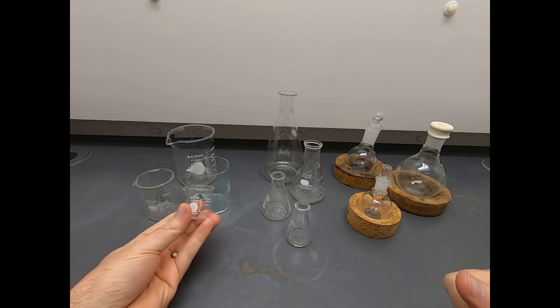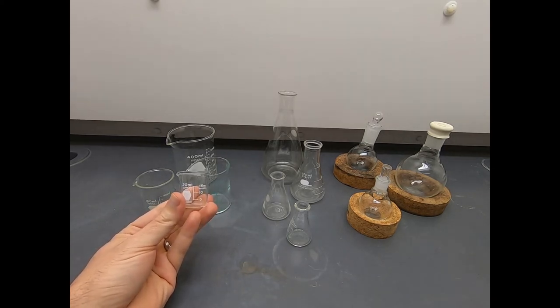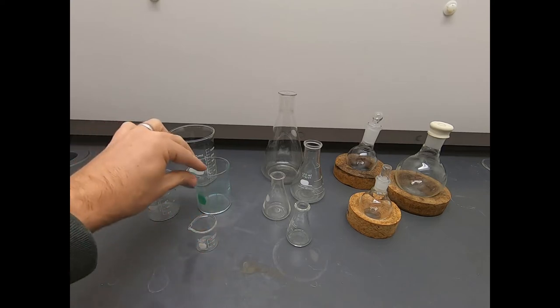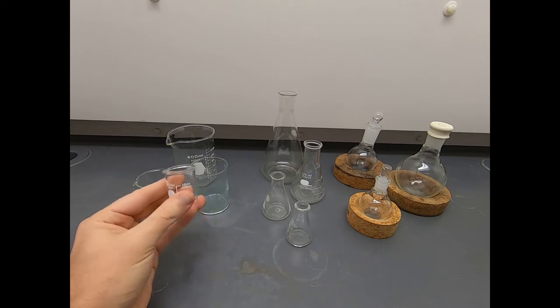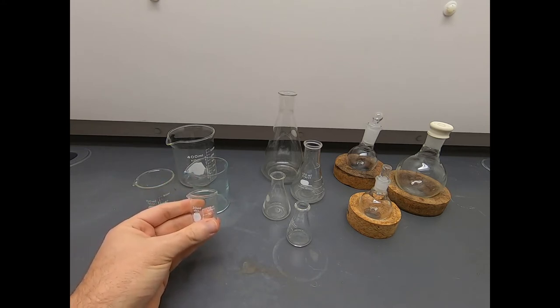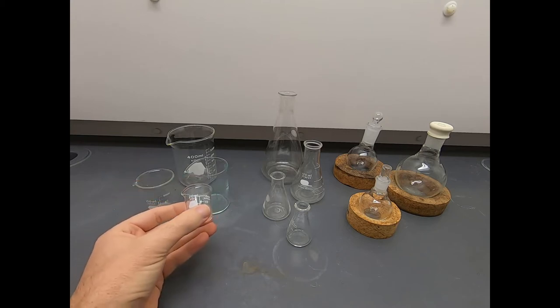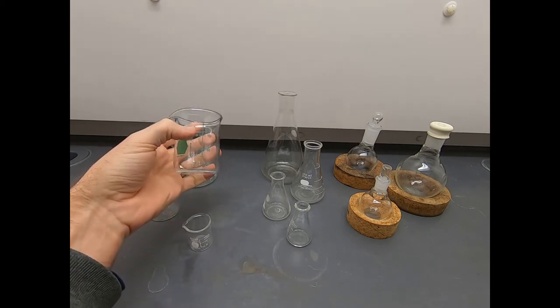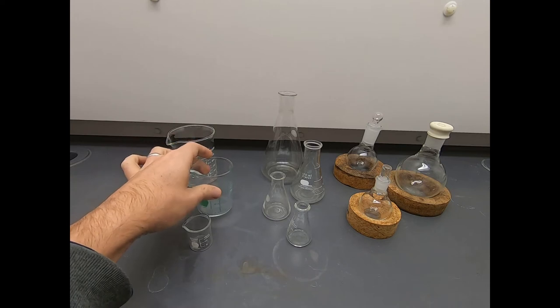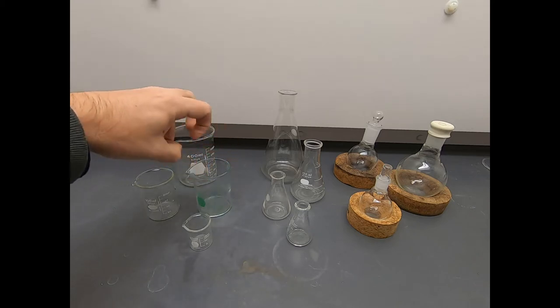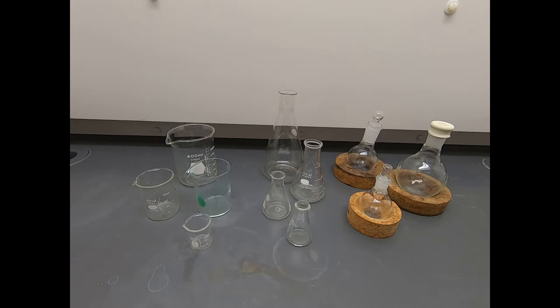Beakers are great for making solutions. Let's say you need to make up 50 milliliters of 1% hydrochloric acid. Beakers are a great container just to mix solutions like that. Beakers are also really handy. They can be used as weigh boats. Sometimes you want to weigh a large amount of solid, and you can use a beaker on the balance instead. So beakers are good for making solutions, particularly where you're not worried about evaporation because these do have an open top. They're fantastic, versatile, and useful.